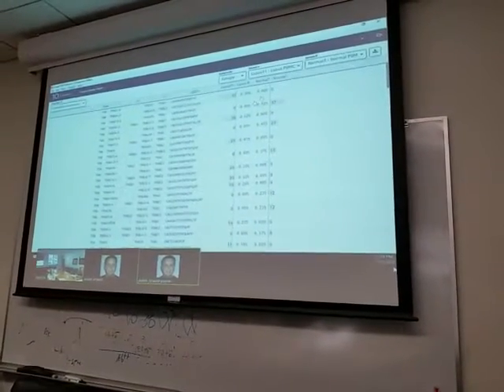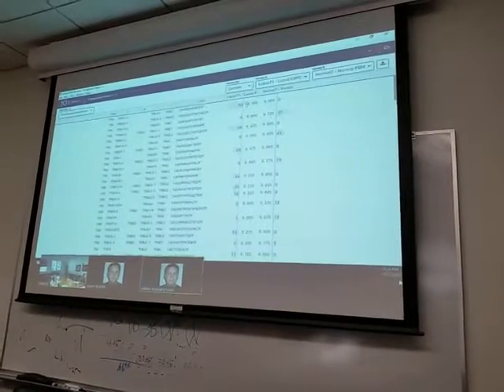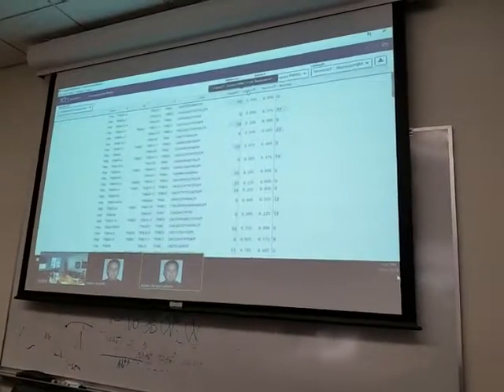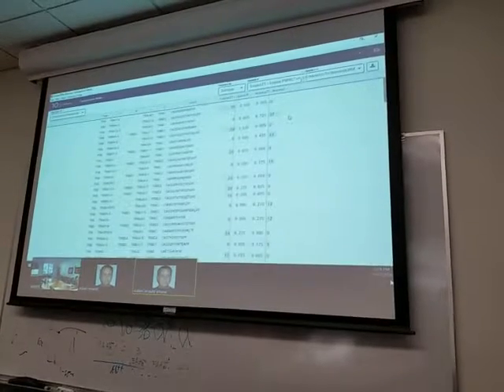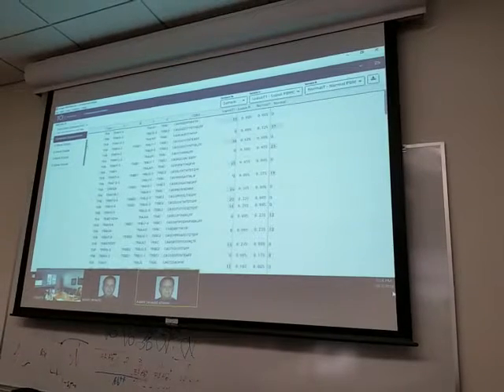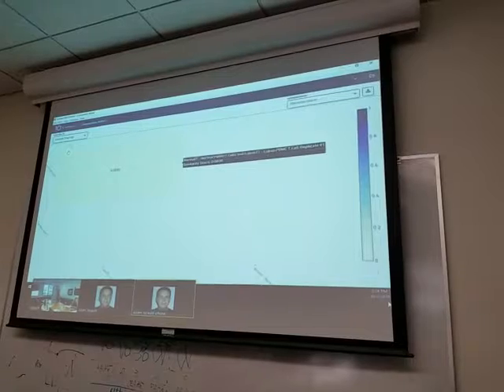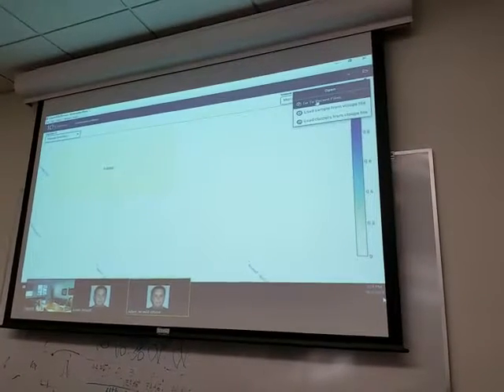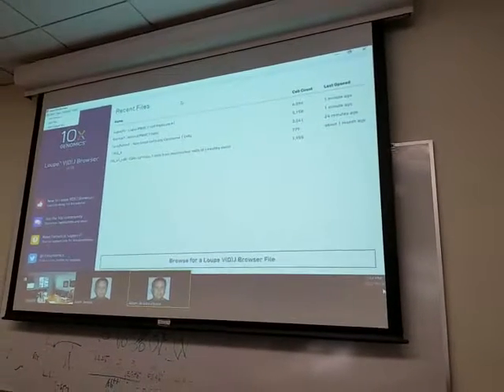And what this is showing is the specific clonotypes that are essentially uniquely represented in one or the other, so the lupus or the healthy individual. In this case, I think there's no overlap, so we don't see any. The other way I could represent this is, I think it's sample overlap here. Let's see. Sorry, I don't do this particular one as much.